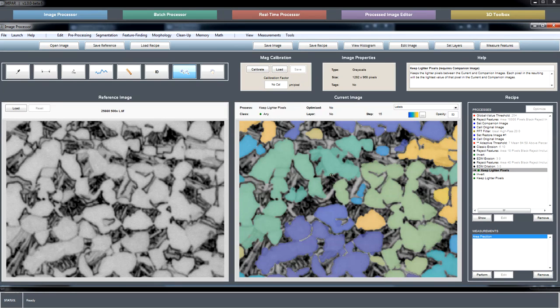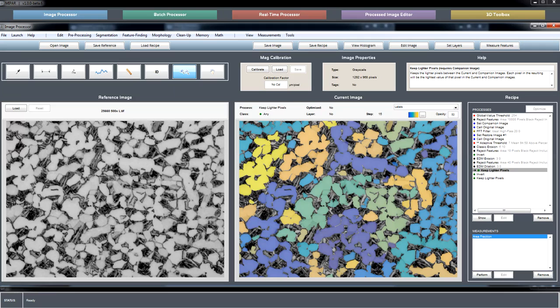Yeah, sorry about the zooming. I'm not sure what's going on there. That obviously needs to be fixed. So, like I said, the layers button is now going to be down here in beta 7.